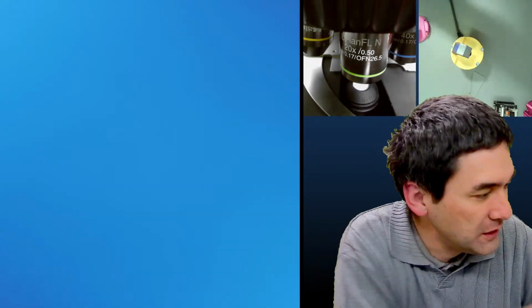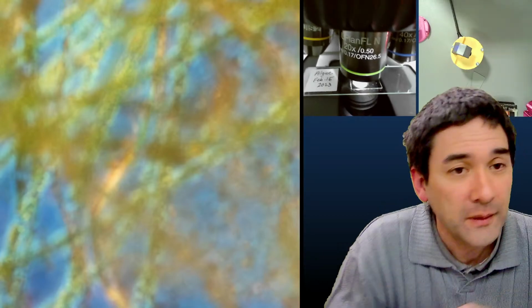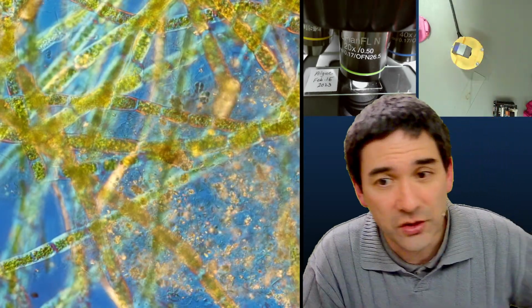Okay, yeah. And here we again have, let me just put this in here for the fun of it. Yeah, that is the regular microscope that I have. Okay, yep. So here, just some algae.